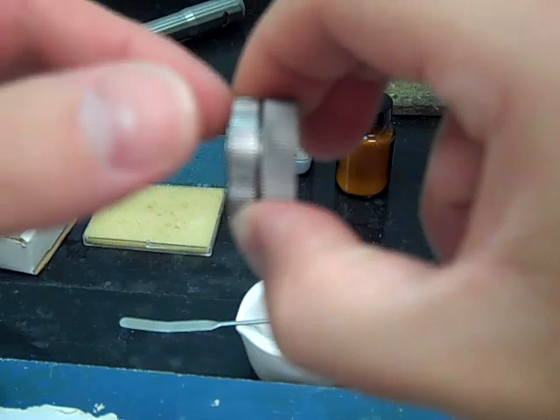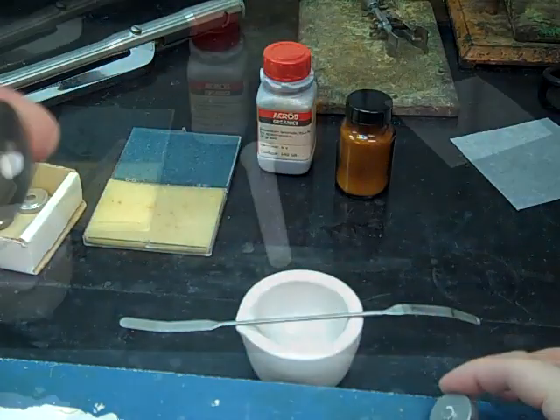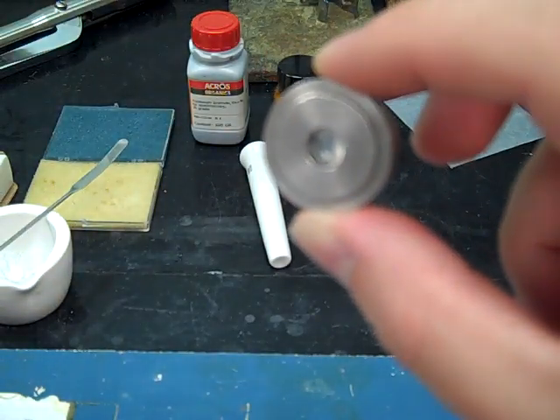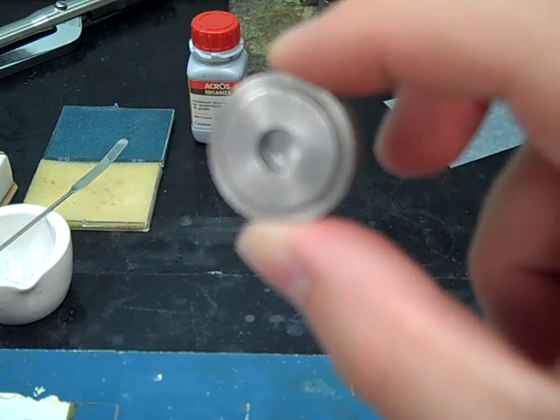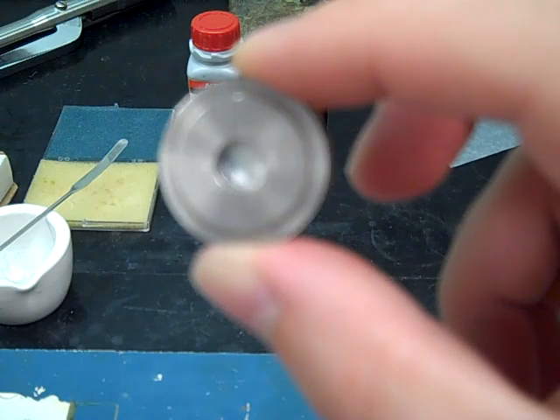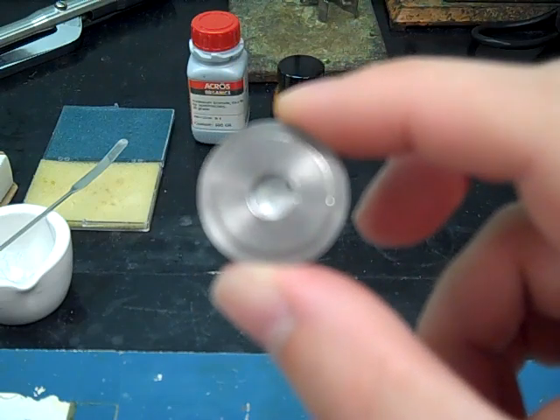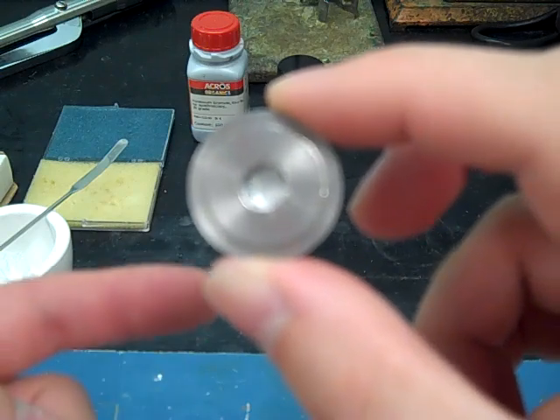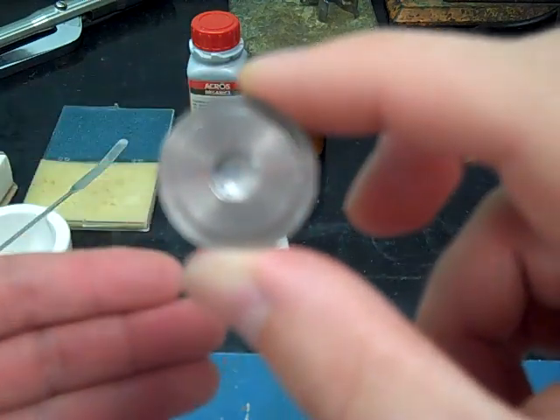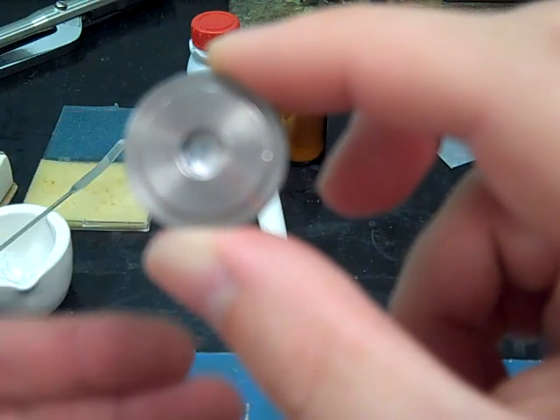Next, you're going to turn it sideways and gently twist off the small bolt. So what we should get out of that is a pellet that's got some translucent character in between the donut. You can see maybe a little bit on this kind of zoom, but there's actually some light that can transmit through, and you can tell it a lot easier if you take your hand. You can kind of see the change in the light when I put my hand up there and then remove it.